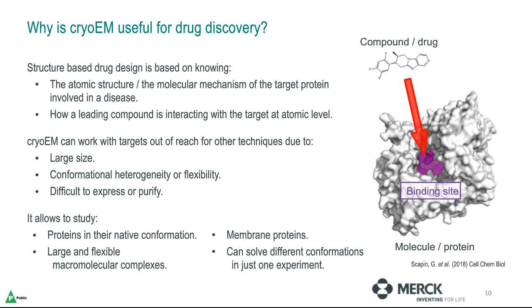So as Ali has explained, in the last few years, CryoEM has become interesting for the field that is called structure-based drug discovery due to the resolution revolution. The classic approximation to this technique, structure-based drug discovery, is given a protein that we call the target related to a disease and a molecule that alleviates that disease by making some effect on that protein, a molecule we call a compound or a lead compound. Structure-based drug discovery is based on the study of how the compound and the target interact at an atomic level under the design of that compound to make it a useful drug.